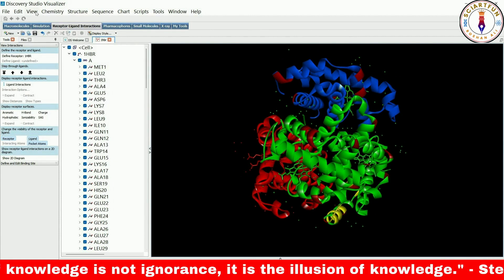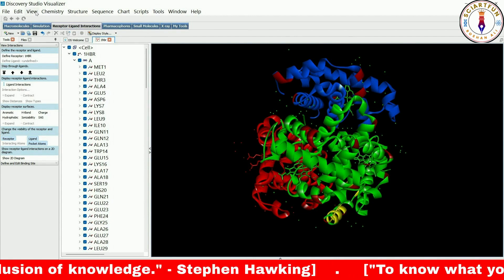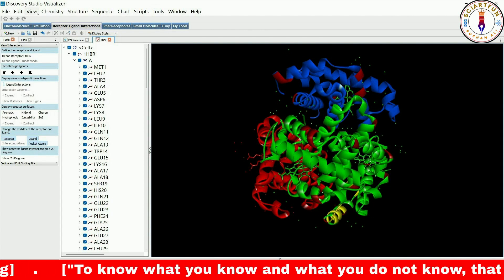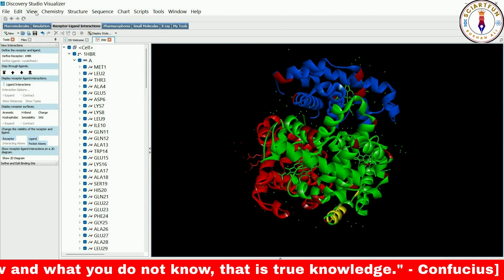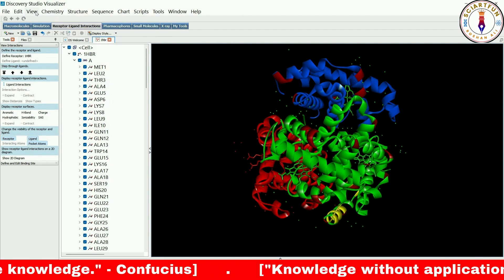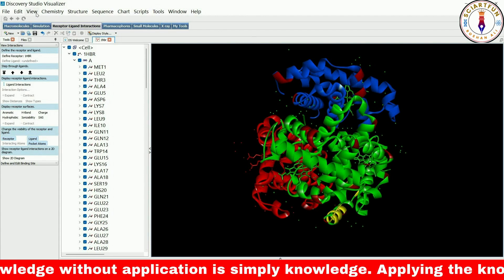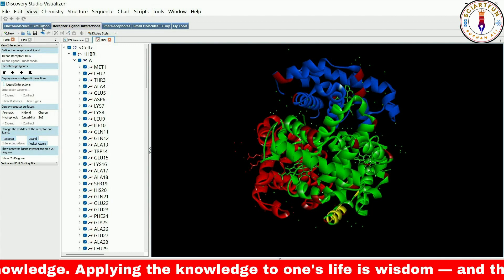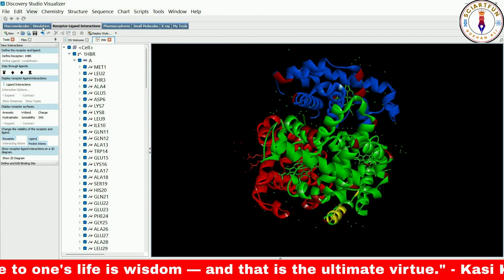Zooming in can help you see smaller features and details of the protein that may not be visible at lower magnification, which can be useful for examining specific regions or making more accurate measurements. On the other hand, zooming out can give you a more global view of the protein, making it easier to see the overall structure and how different regions fit together. This is especially useful when working with large or complex protein structures or with multiple protein models at the same time.